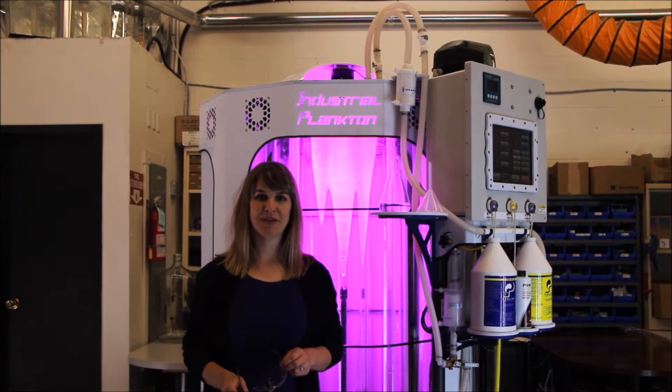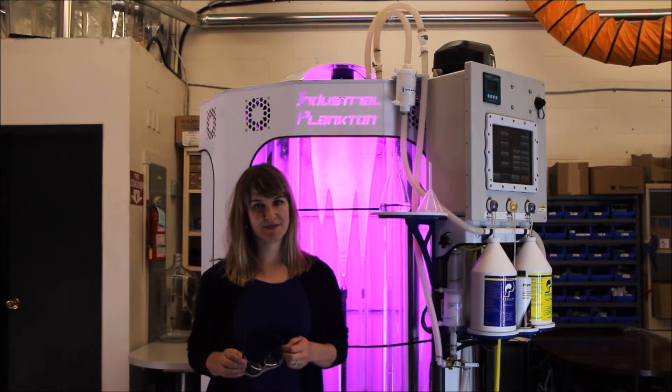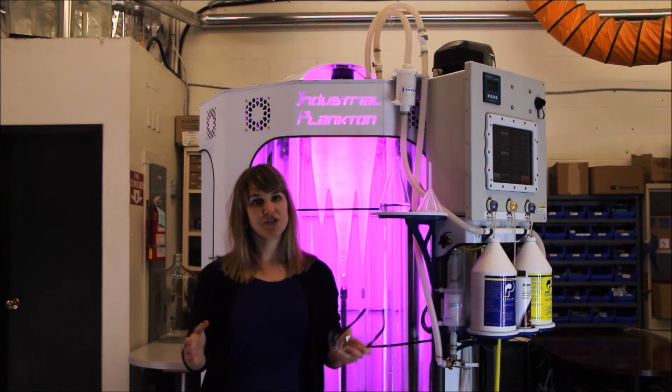Hello! Today at Industrial Plankton, we're going to be taking a look at the 1,000 litre algae photobioreactor and its cleaning cycle. I know many of you who have cultured algae before probably aren't the biggest fans of scrubbing tanks, so we're going to show you how simple it is with this automated system. You might want to run the cleaning cycle between cultures, after a few months, or if you would like to re-inoculate with a different strain.